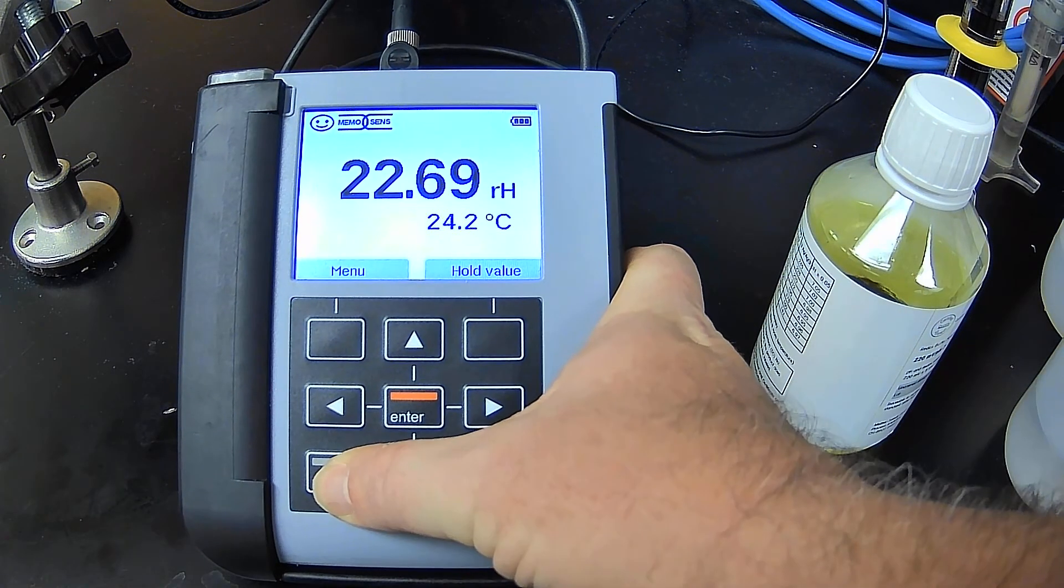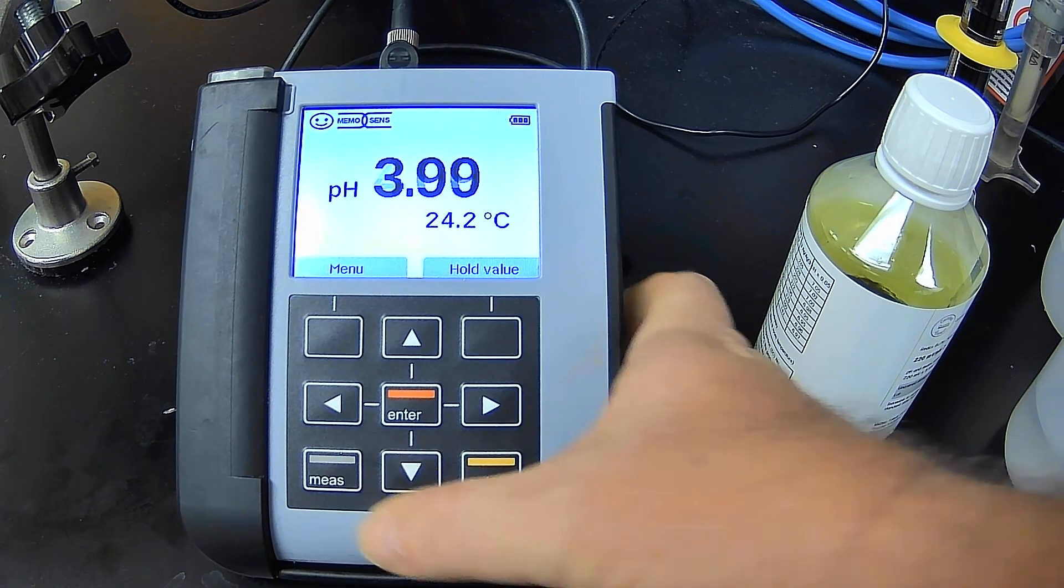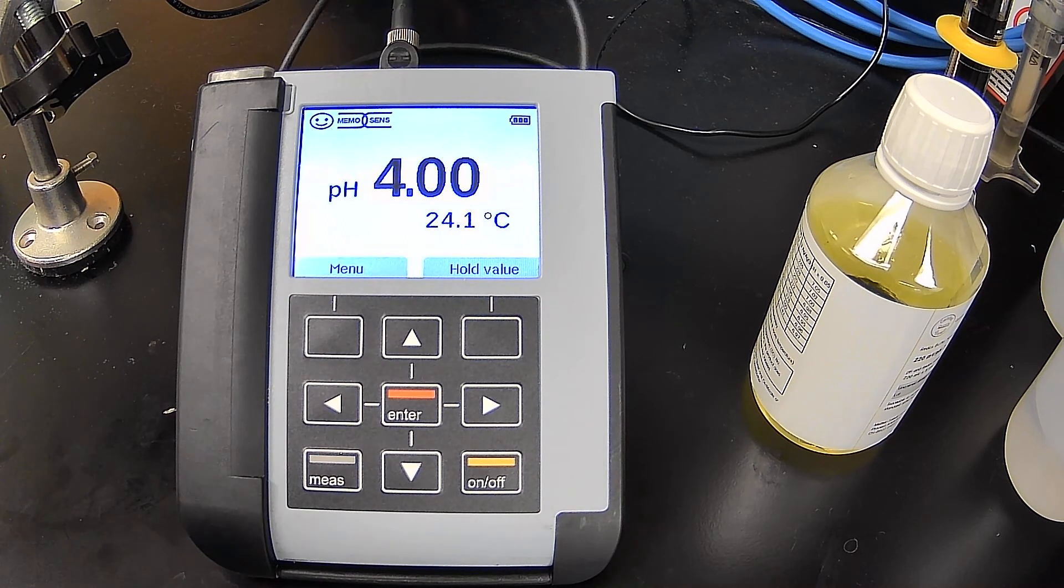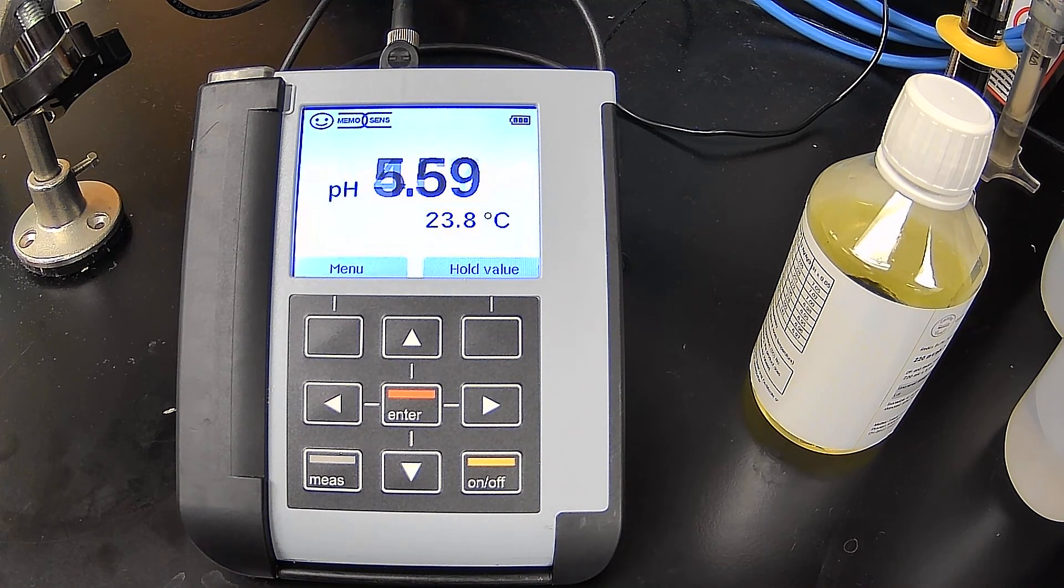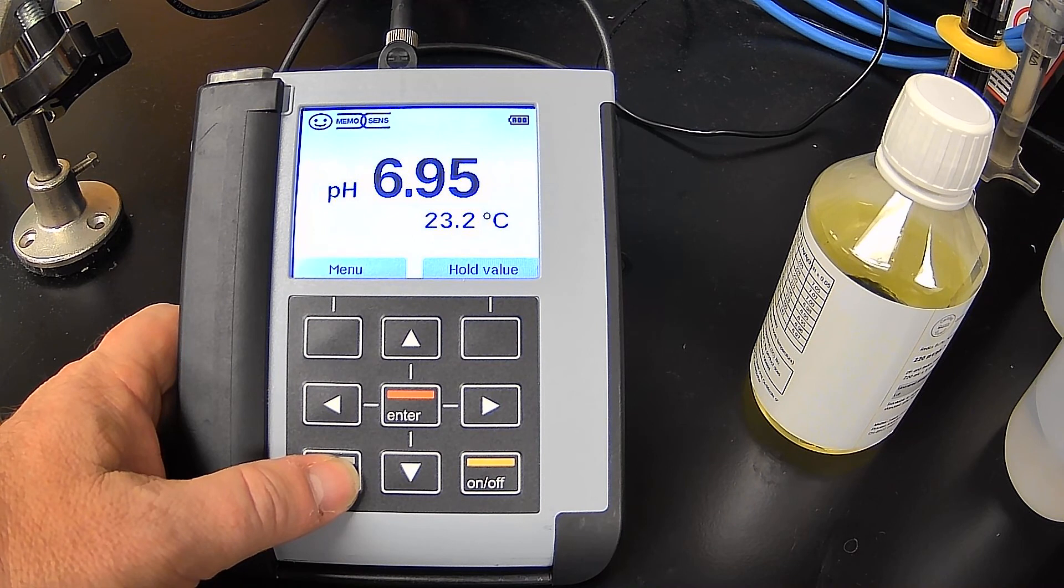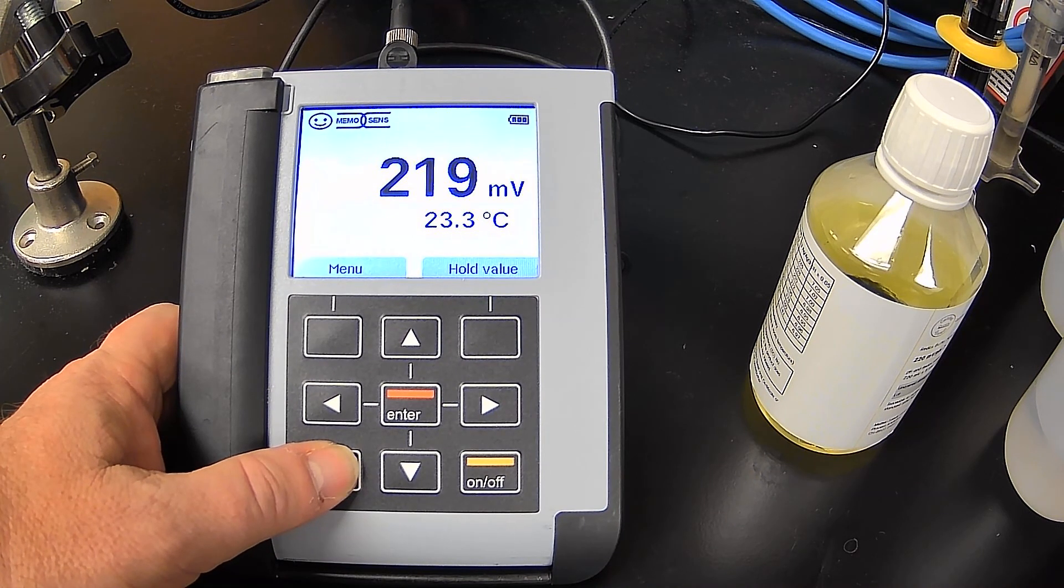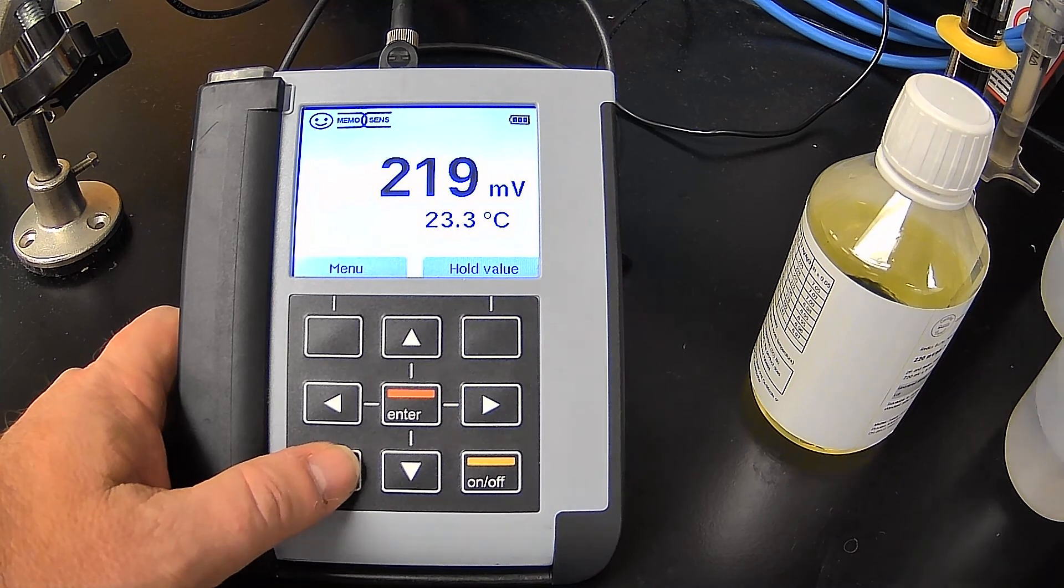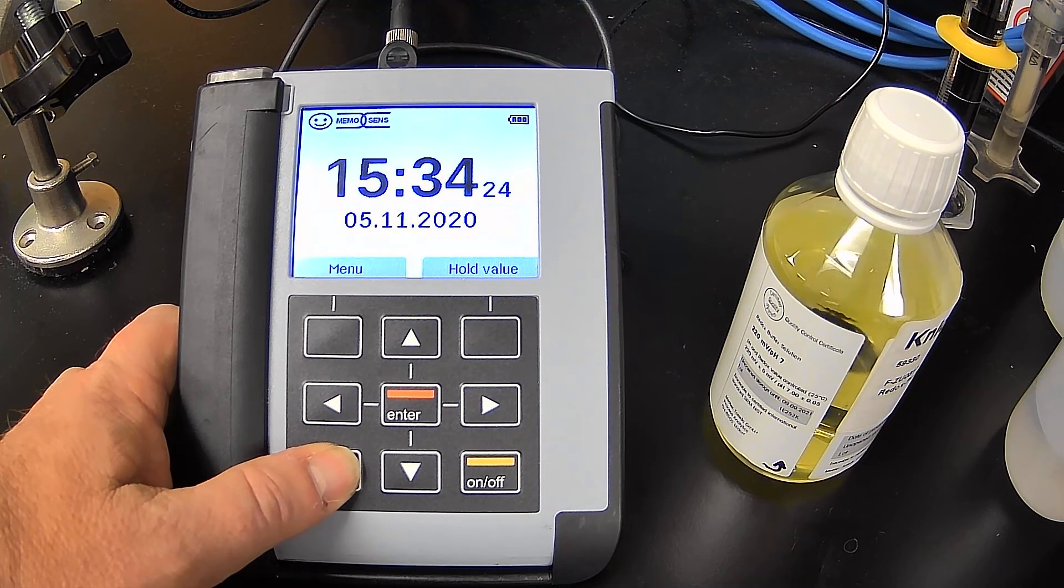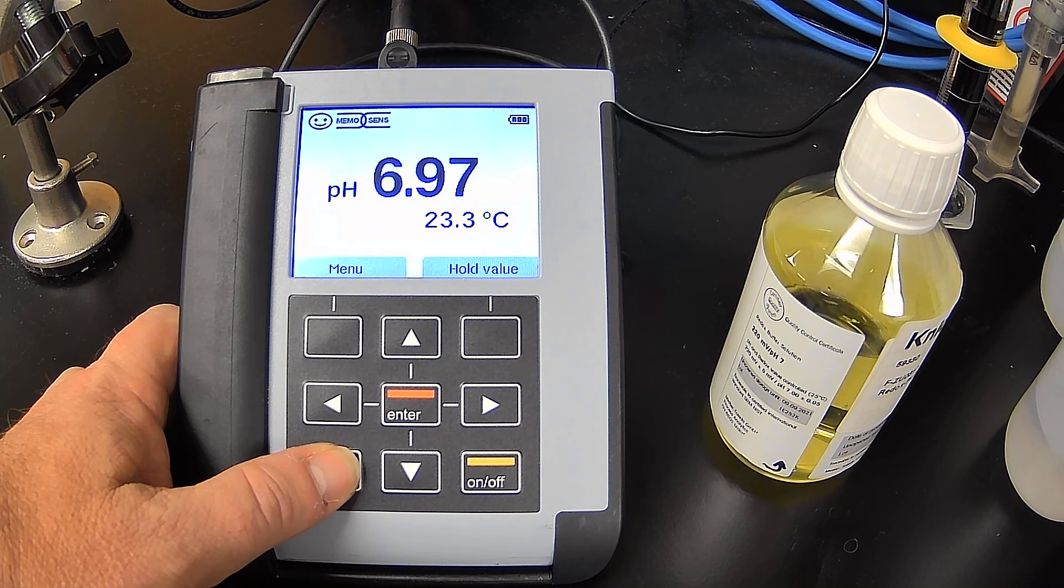There we go. And there's our pH value. 4. I'm going to go ahead and move it over to the 7. You can see it coming up. And we'll take a look at the ORP value, which is 219. And by the way, what you don't see is that we're in the same ORP solution we started with, which is 220 millivolts, and also a buffer of 7. 6.96. I'd say we're in good shape.